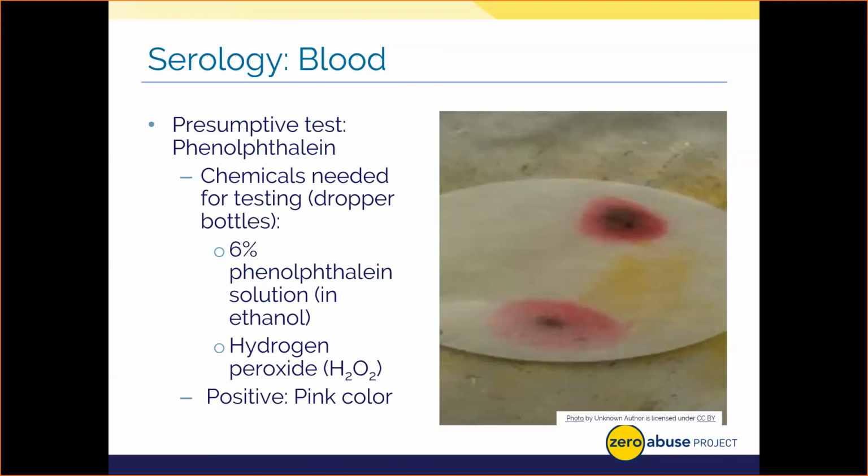There are many opportunities for other compounds, such as plant byproducts, to cause false positive reactions. Because some plant components can effectively induce a false positive for phenolphthalein, coupled with the knowledge that this test doesn't tell us if the blood is human or not, we actually have to use a confirmatory test to make sure we are indeed looking at human blood.